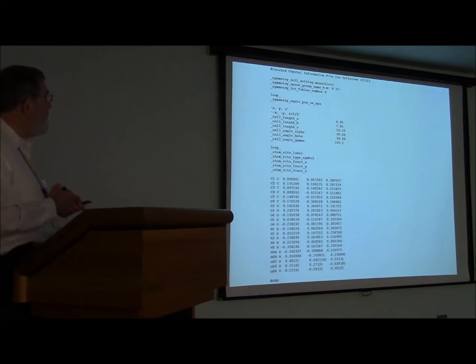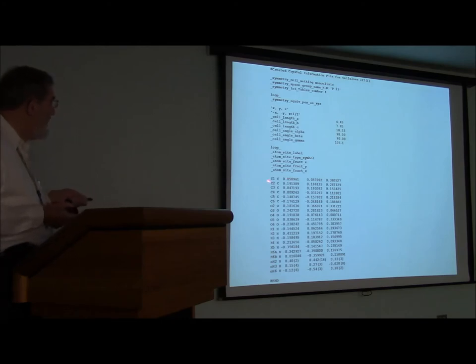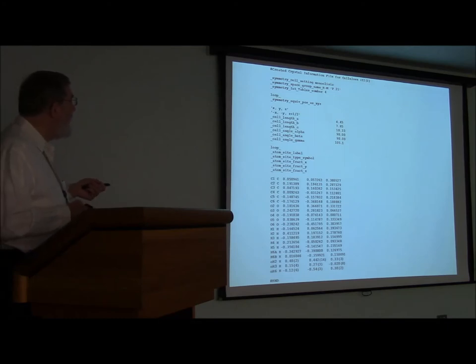So one of the things that you get when you do a crystallographic study of the atom positions is a list of the X, Y, and Z coordinates for the different atoms in the unit cell, along with the unit cell dimensions. This is for cellulose 3 sub 1, which is a very simple unit cell. And this is the entire information from a crystal information file that I created by typing it up from the published coordinates of the paper.